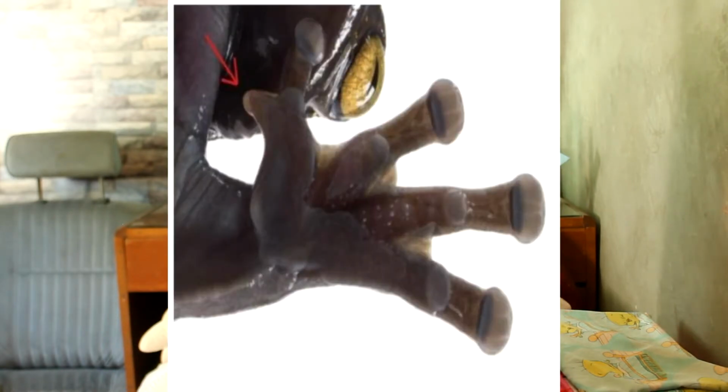So, upat ra na siya ang sa forelimbs. Ang prepollux, kay ang rudimentary or not yet developed na first finger sa frog. It is a shorter stump on the inner side of the hand. So, bali, dili kay siya develop. Okay. Rudimentary man.